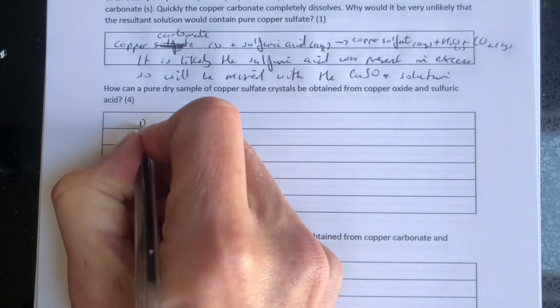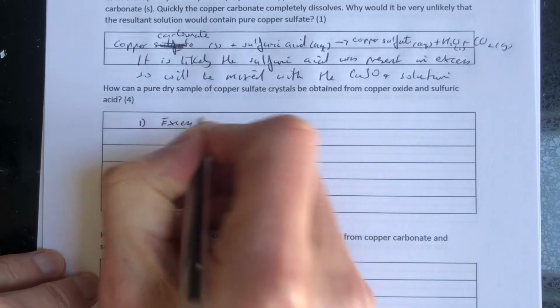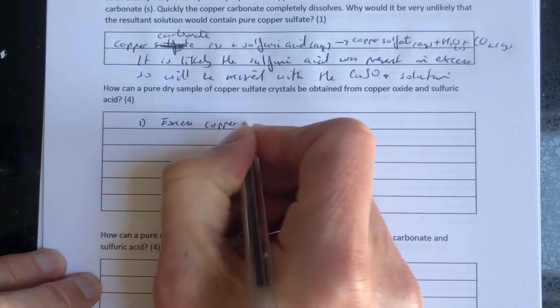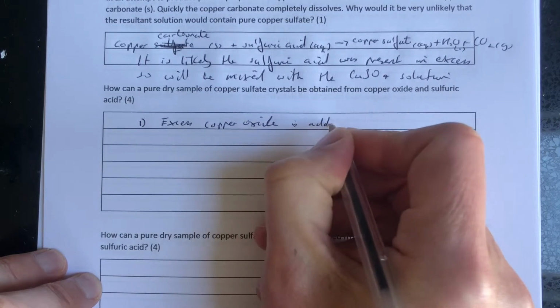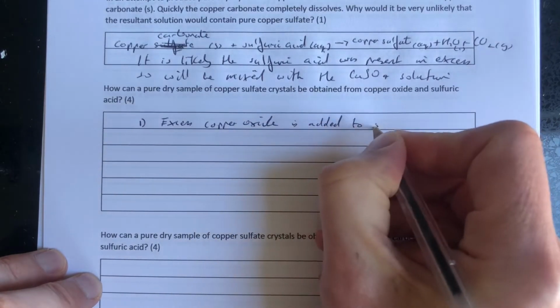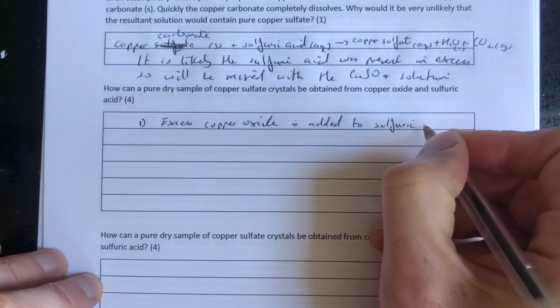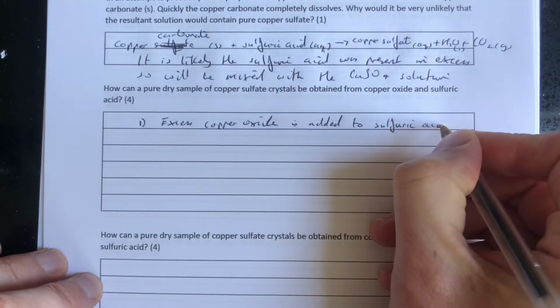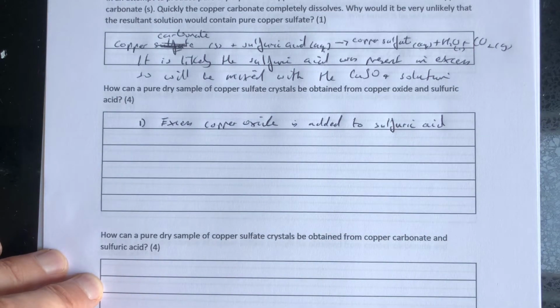Number one, excess copper oxide is added to sulfuric acid. We have to have an excess of the copper oxide. It's insoluble. So that will make sure all the sulfuric acid reacts.